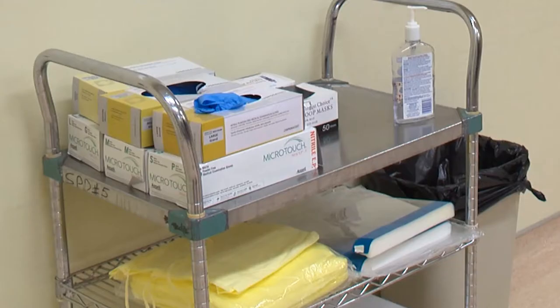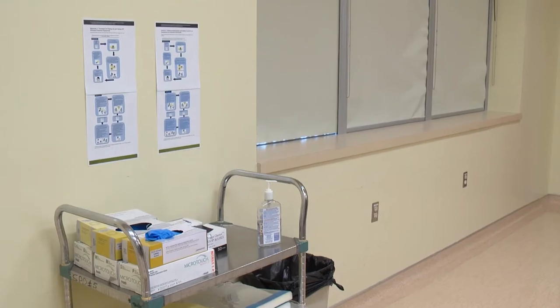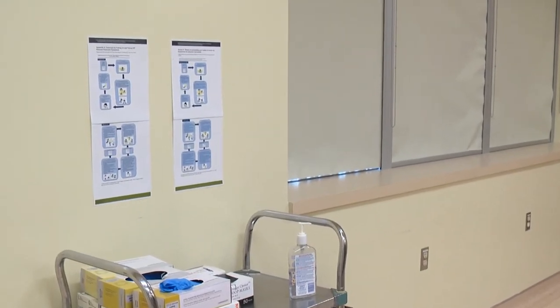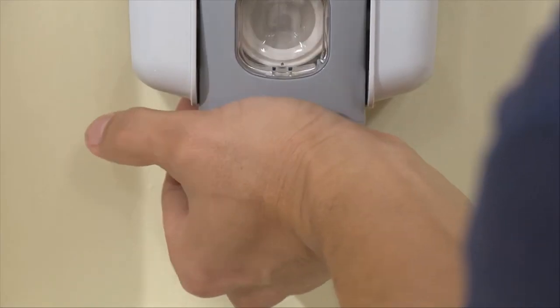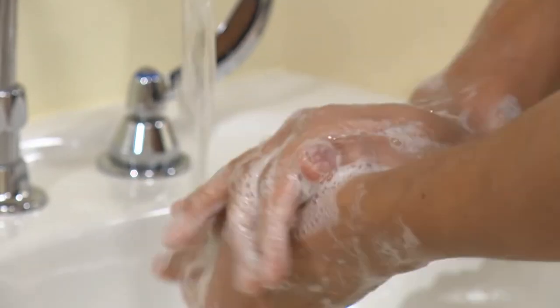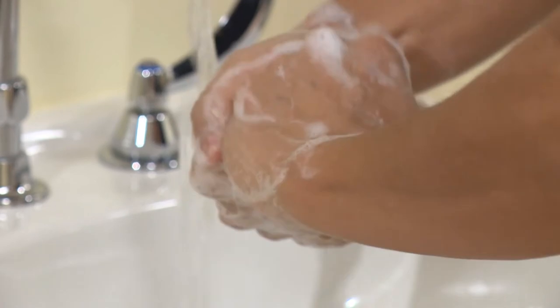The way to put on PPE may differ depending on the types of PPE used at your health facility. First, always perform hand hygiene using alcohol-based hand rub or soap and water if your hands are visibly soiled.